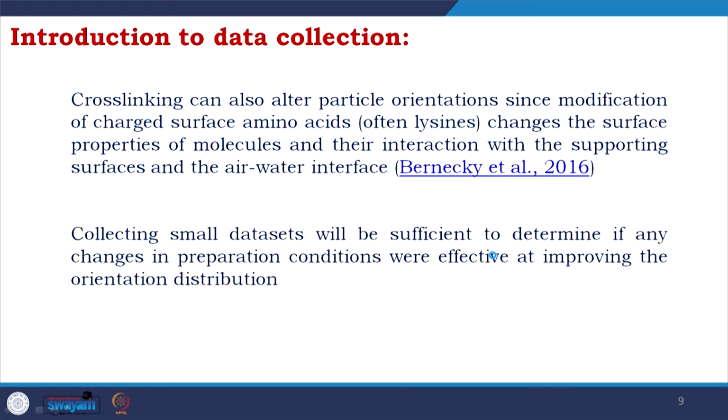Collecting small data sets will be sufficient to determine if any changes in preparation conditions were effective at improving the orientation distribution. So, when we see that we have to check and go back, we should collect small data sets, not spending more time on initial data collection.